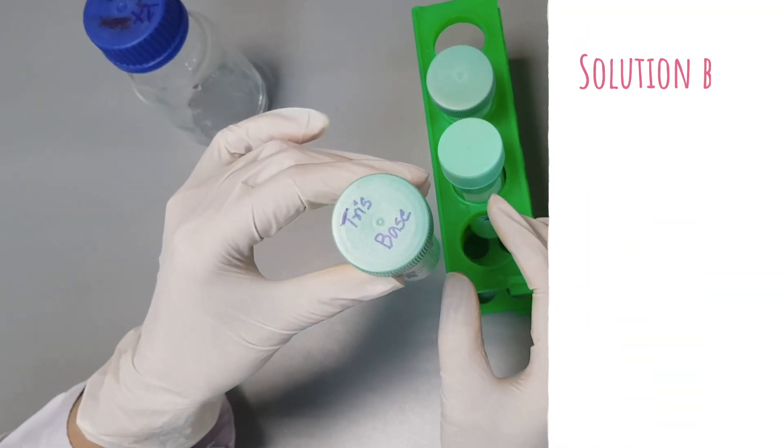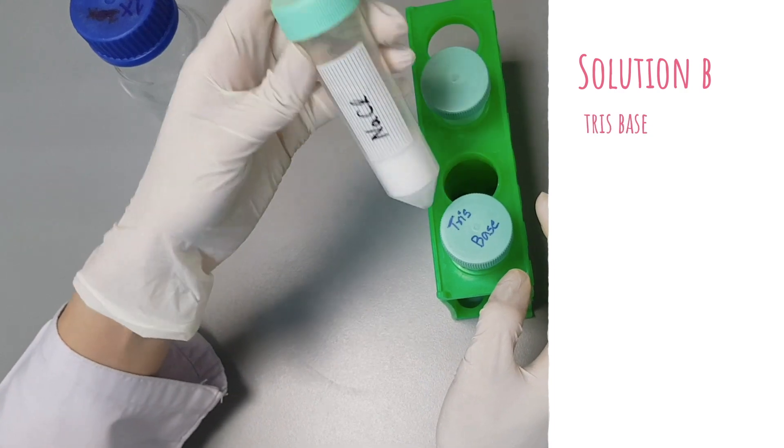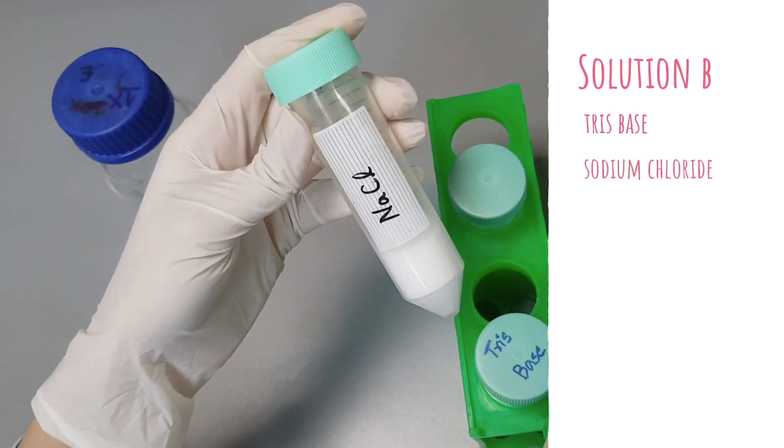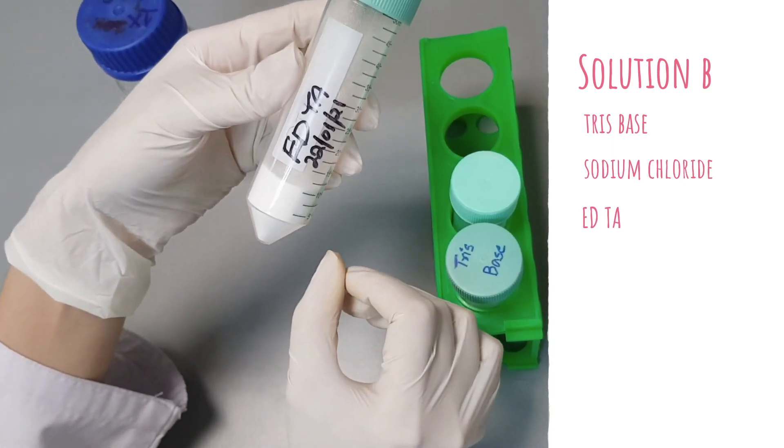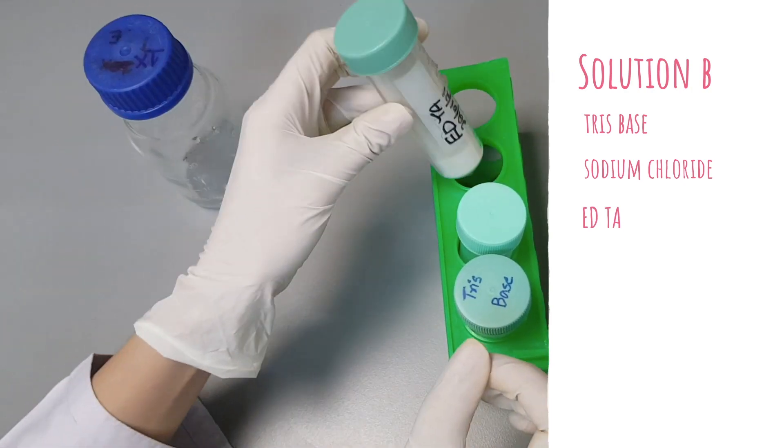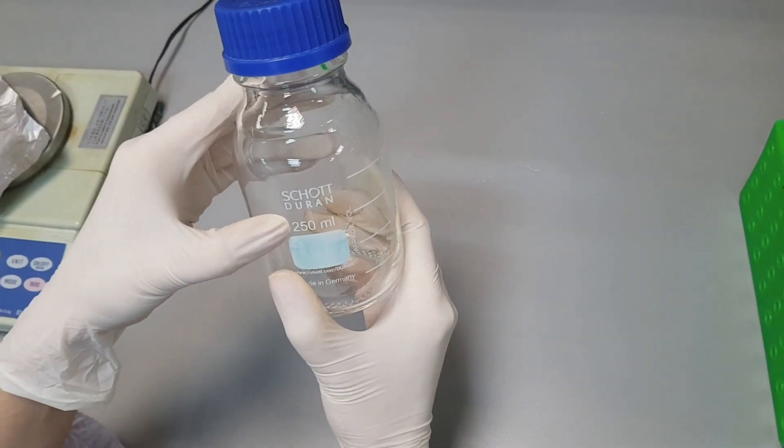Now to prepare solution B, the reagents we require are tris base, sodium chloride, and EDTA. Take a reagent bottle for preparing 150 ml solution B. Pour 100 ml distilled water in a 250 ml reagent bottle.